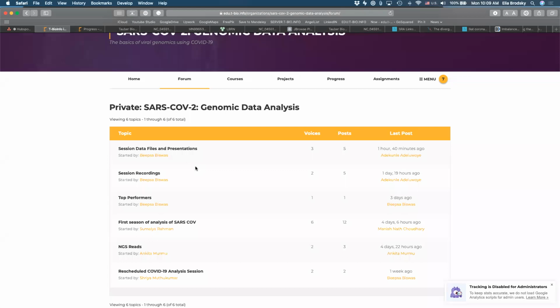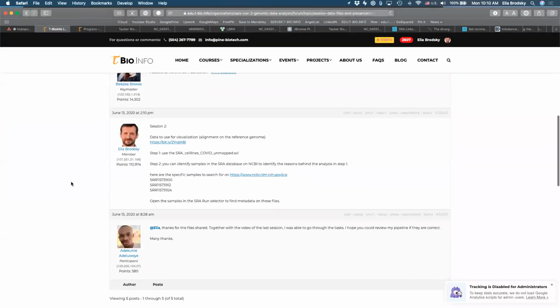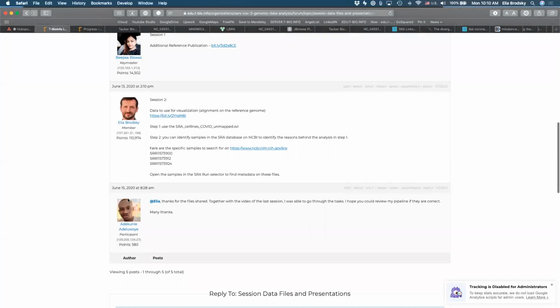Okay, excellent. Yeah, so you'll see some of these things here. And the point was to really point you to some of those materials. I'll just show you, for example, where to find that: session data files and presentations. If anyone wants to have any kind of a reference publication that you saw me reference, or a data set that you couldn't find, I'll be posting them here. And if you have any questions, you're welcome to add more. Like, for example, Adekunle added here that he ran the pipeline, and I can take a look at that pipeline. So we'll go over that today.